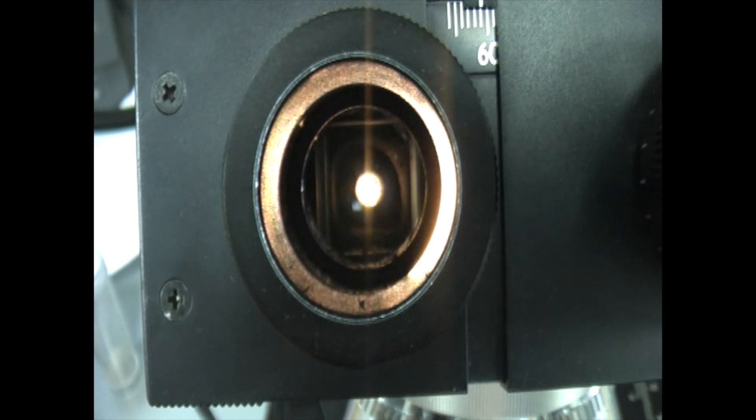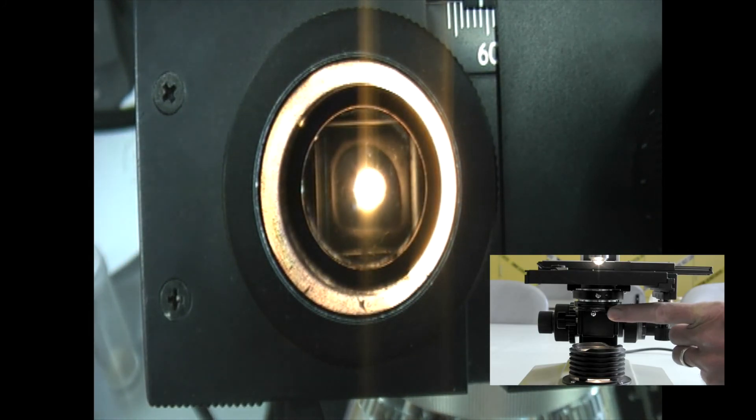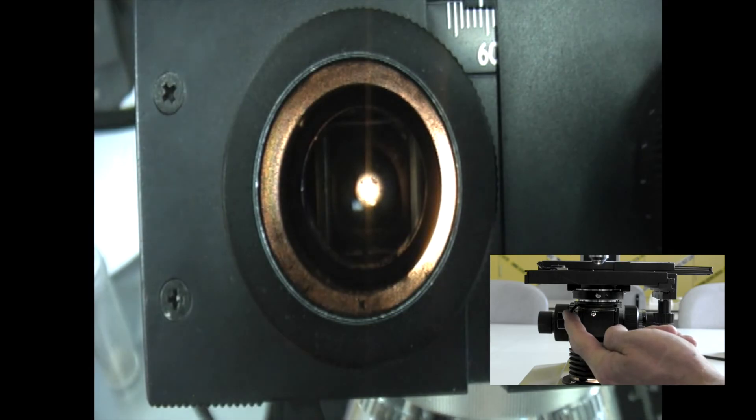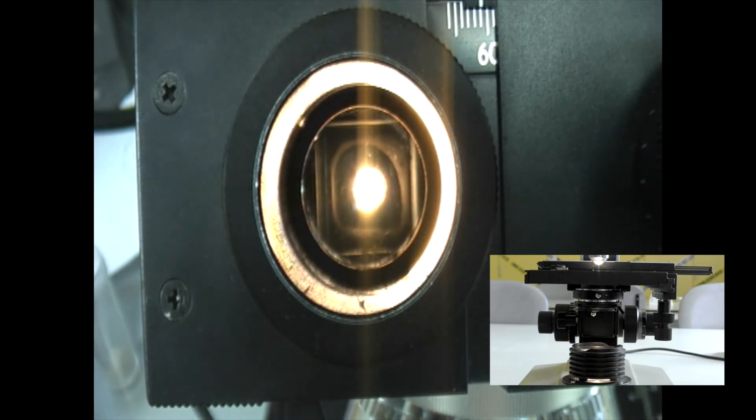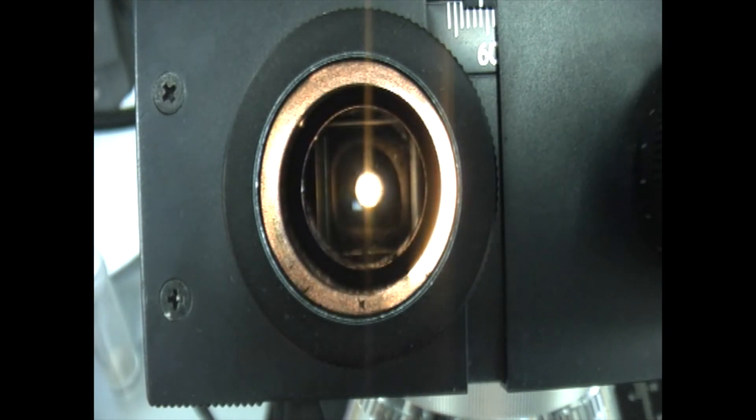Now take hold of the iris diaphragm lever, that's under the condenser and sticks out of the front, and move it back and forth. You will see the blades that make up the iris move in and out, making the aperture smaller and larger.